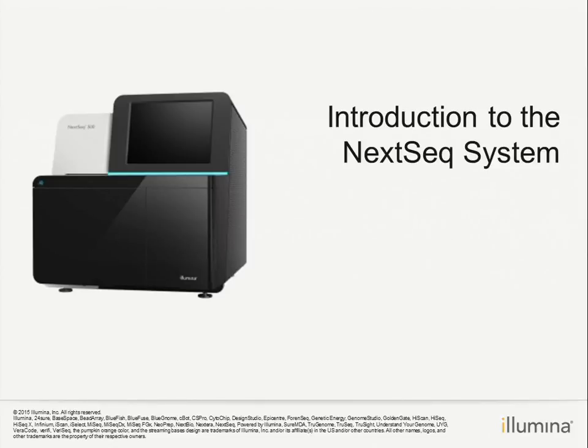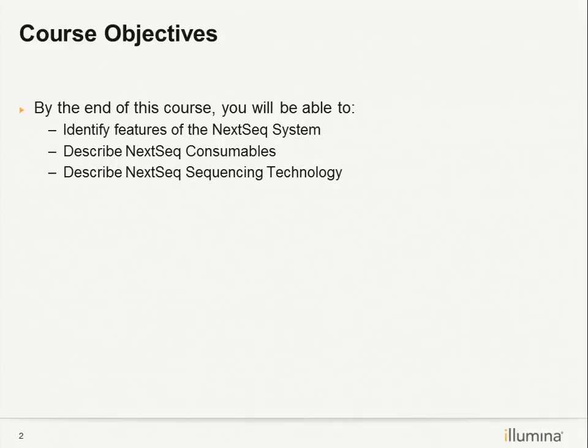The main difference is that the 550 has a scanning function for Infinium arrays as well. So good news is that you can upgrade anytime. If in future you are interested in doing Infinium microarray, you can upgrade your NextSeq 500 to NextSeq 550. But for the sequencing part, they're basically the same.